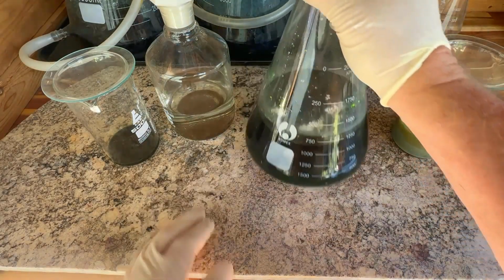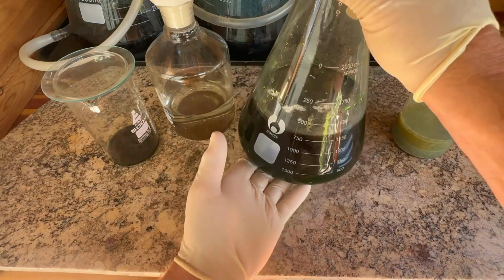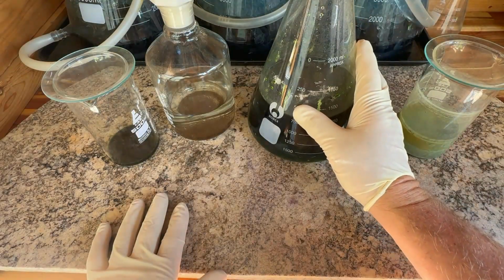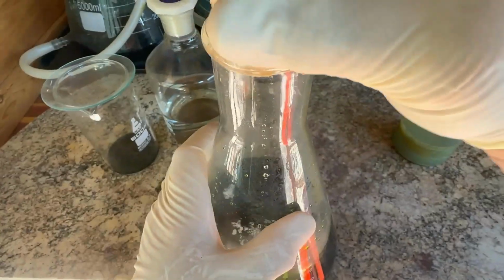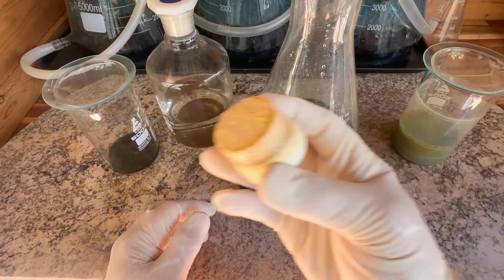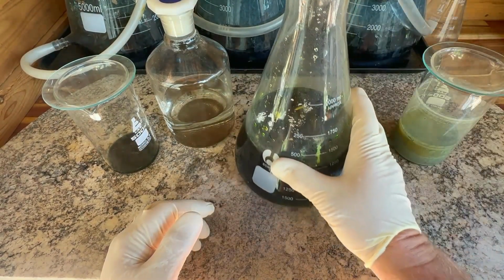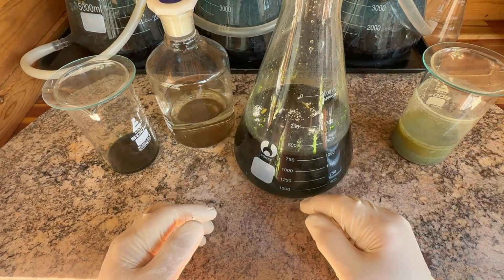And then third here, we have this ugly solution. You can see there's a whole bunch of floaters in there. It's pretty ugly, and I'm not even sure what it is. We'll probably do that in a separate video and talk more about how and where that came from. As you can see, whatever's in there is eating up this stopper. You can see some of it just fell in there again. But I'm pretty sure there's values in it.